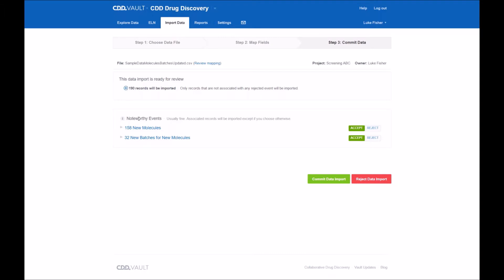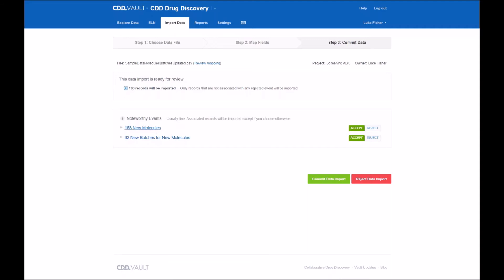As you review the QA of the import please note from this screen that this is the ability to review what's happening. It gives you a chance to accept and reject different operations. Here on this simple input file I had some noteworthy events so these are ones that you might want to take note of but not necessarily errors or issues that you need to resolve. In this particular input file there were 158 new molecules and of those 158 new molecules 32 were in fact duplicated so we won't have 190 new molecules we'll only have 158 new molecules but 32 of those will have more than one batch. And certainly you can accept and reject that depending on your needs.